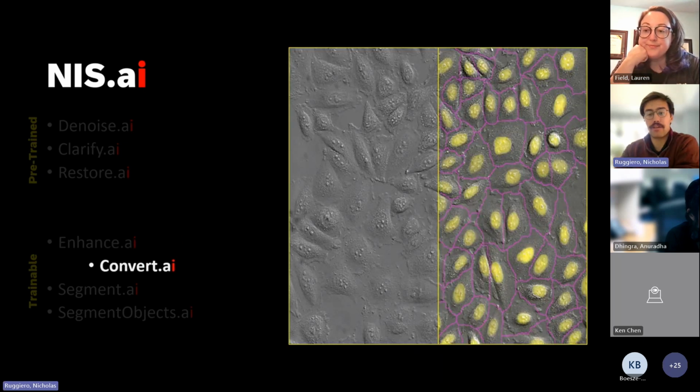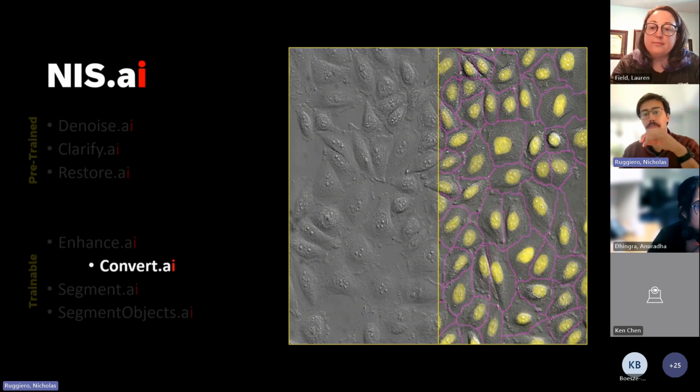The next one is going to be convert. This one can be a little bit confusing, but you guys actually sent us one of the data sets that we trained convert on, and it looks really cool. So it will create a fake channel from a standard channel that we give it.